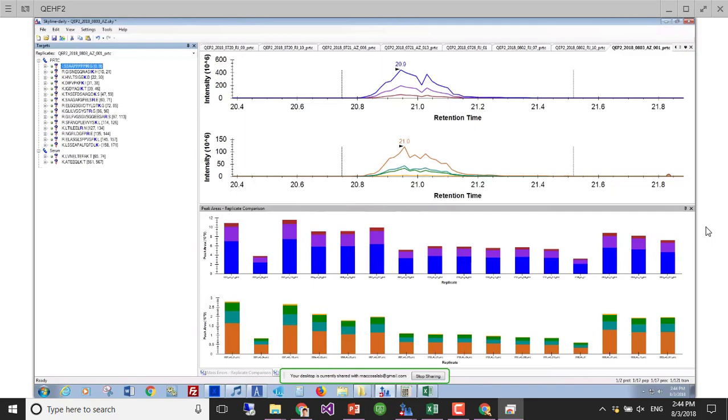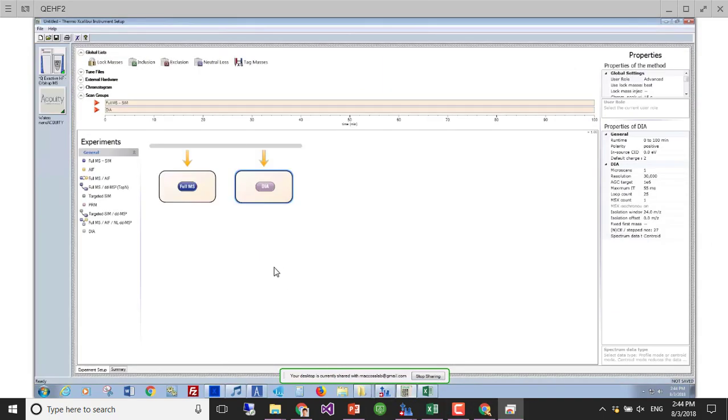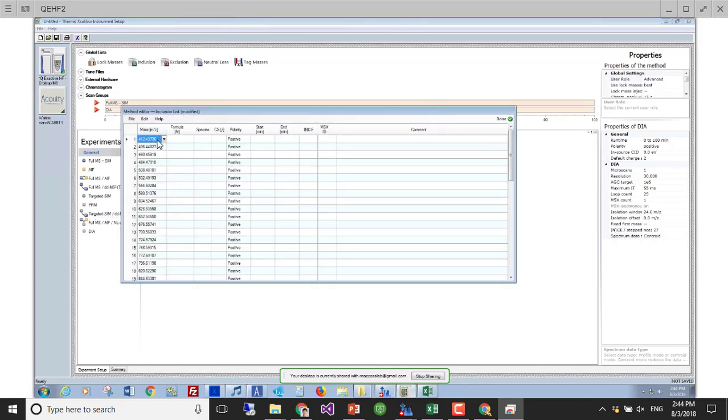So in case of the PRM, you would basically list the ions here only? Yeah, so you would want to use maybe the PRM setting here, but it's actually very similar. So in the inclusion list, you basically have this, and that's actually kind of an interesting point, that to an instrument, PRM is DIA, and DIA is PRM. Right?